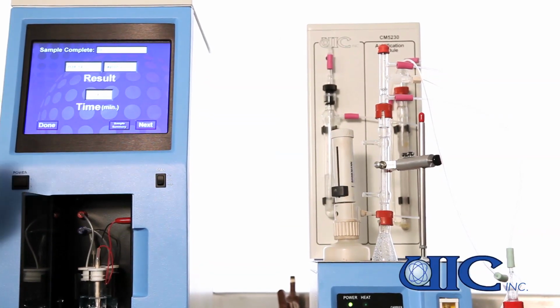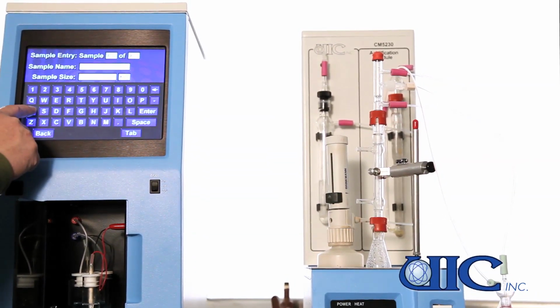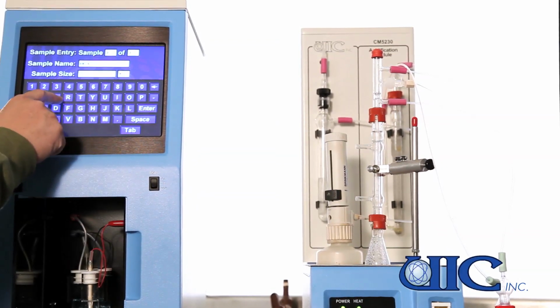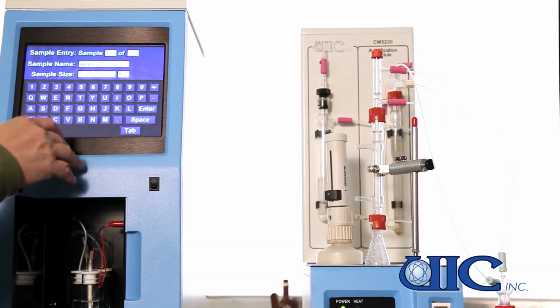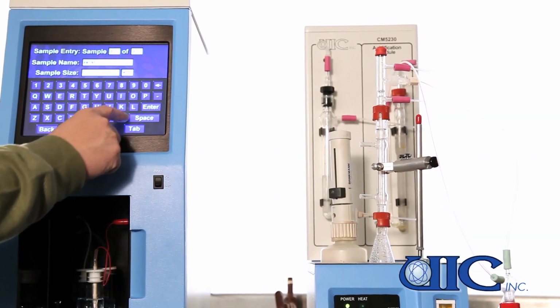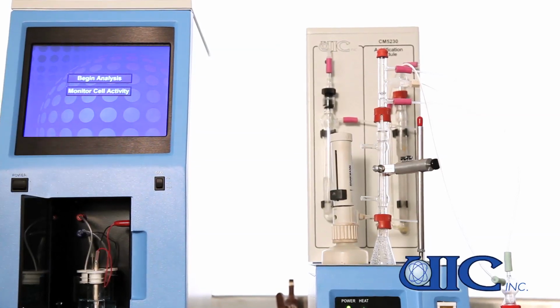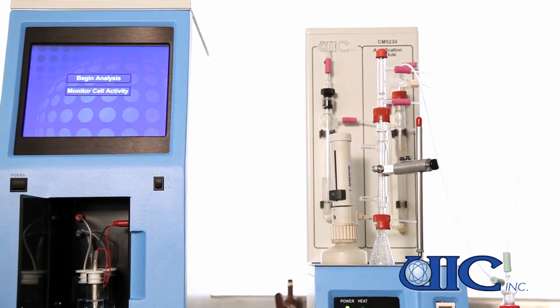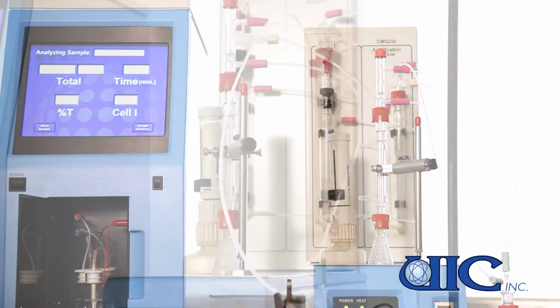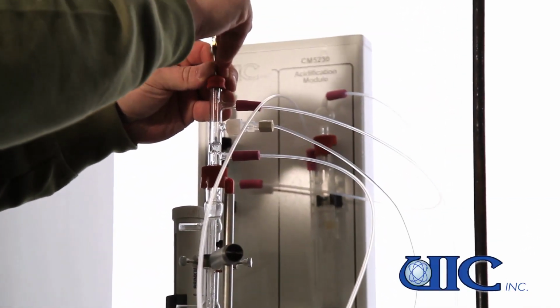What I'm going to do next is hit the next button and enter in our information for our amine. We'll just call this amine. And again, we're using a 0.5 milliliter sample size. Again, we don't have to monitor cell activity because our sample flask has stayed sealed. So we'll hit begin analysis and inject our sample, just as we did with the standard solution.